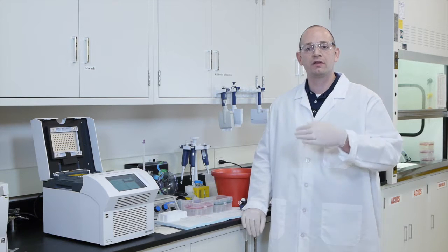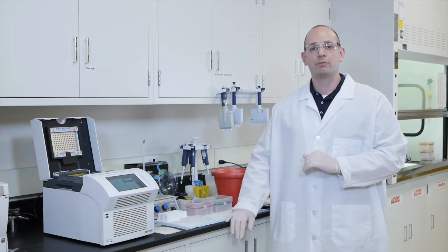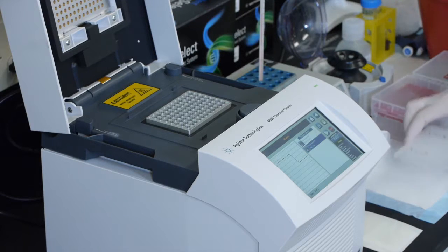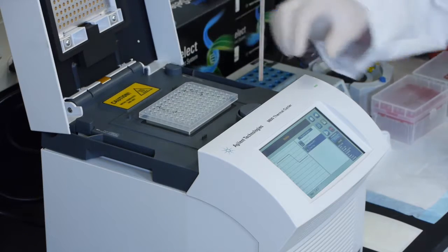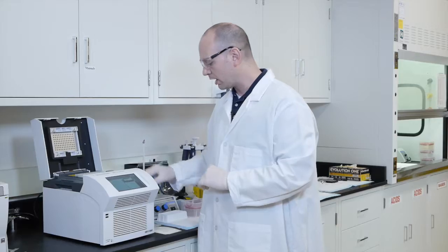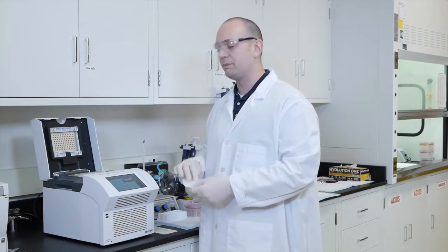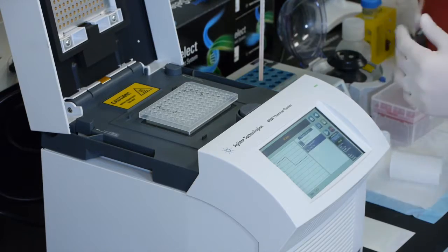So the first part of the hybridization involves preparing the library with the blockers that you've mixed together and putting that in the PCR plate. The PCR plate will then go onto our PCR instrument, and in this case we're utilizing an Agilent 8800 SureCycler. That PCR plate will then be sealed and incubate at 95 degrees for 5 minutes.